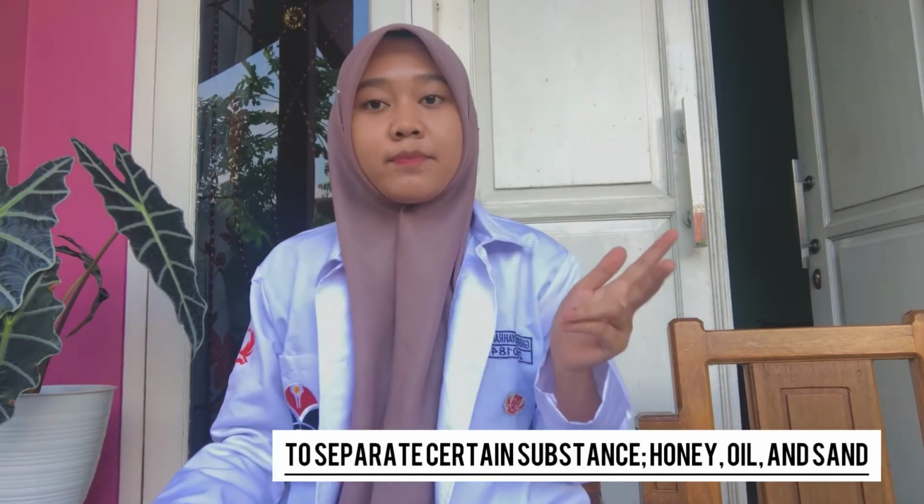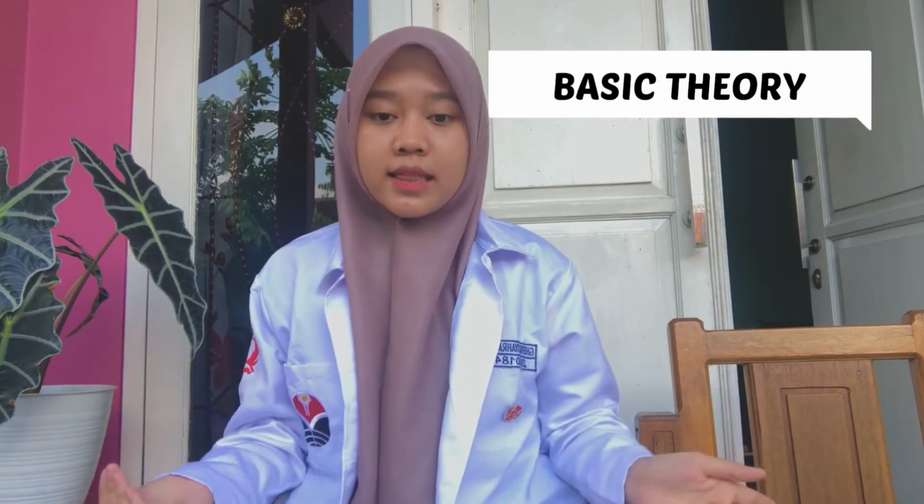So in this video, I will tell you how to separate certain substances, which in this experiment are honey, oil, and sand. First thing first, we know that honey and oil have a different density. The density of honey is 1.4 gram per centimeter cubic, while the density of oil is 0.9 gram per centimeter cubic. If the mixture was made from substances that have different density, we can separate them by using decantation process.